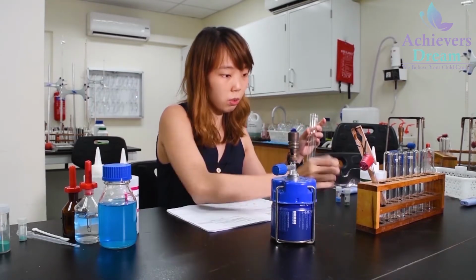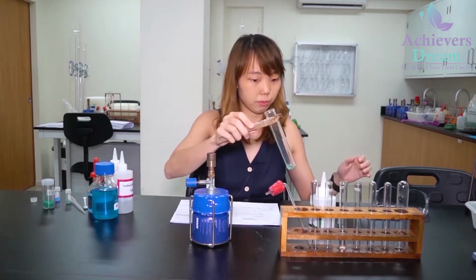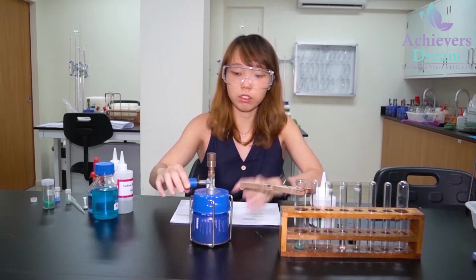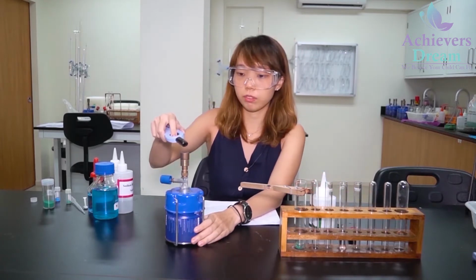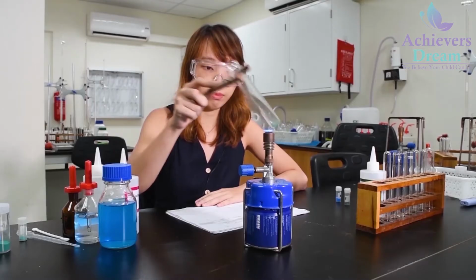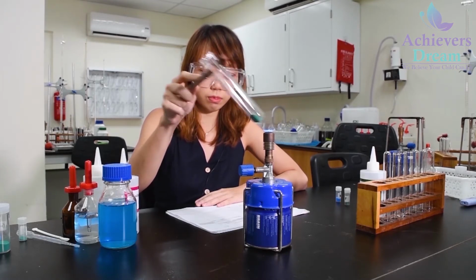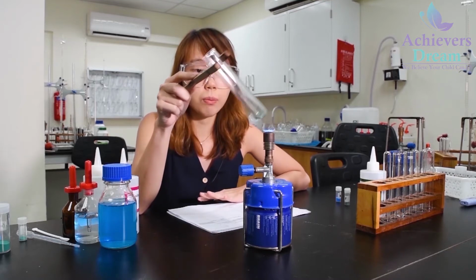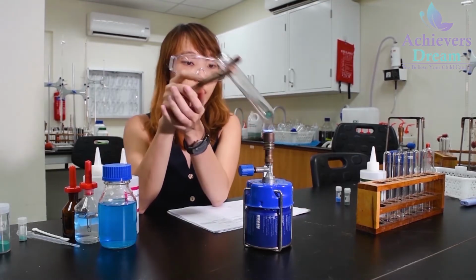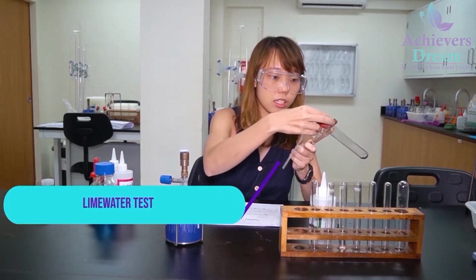So the instructions say to heat the test tube gently, followed by more strongly. And also, as you are heating, you realize that there is some colorless gas being produced. So you have to do identification tests for this gas. I'm going to be doing the lime water test.